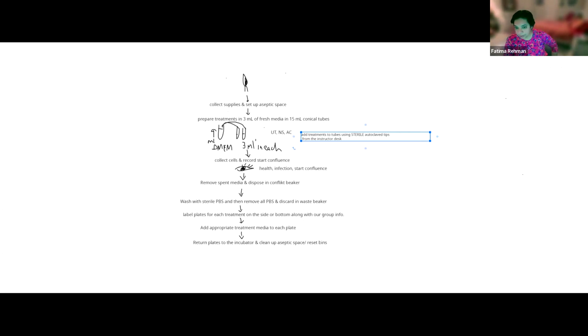So we're going to actually do that next. We are going to make sure that we have the amount of supplement or amount of drug you need to add to each treatment correctly calculated so I can make sure that I am treating them the way you would have. Okay? So remember, I'm just your technician today. So if you measure wrong or calculate wrong, then we would be in trouble.